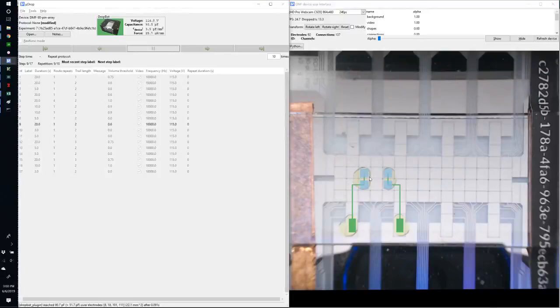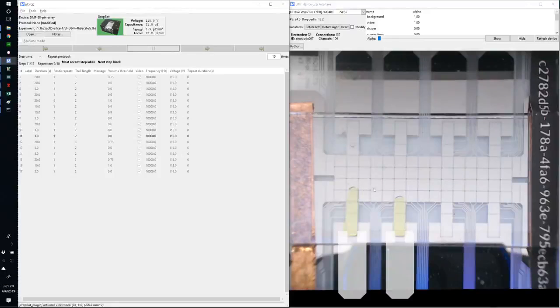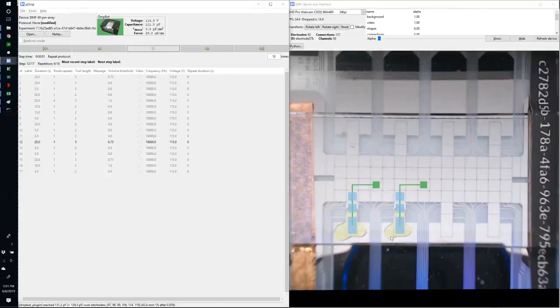Now, this is repeatable on this chip where the left side gets more volume, and so I'm bringing to compensate for that and allow the protocol to repeat. I'm pulling the liquid back into the corresponding reservoirs, and then bringing the entire reservoir volume from both of the reservoirs onto the chip, merging them together, and then splitting that bulk volume into 2 again, so that both reservoirs should have approximately the same starting volume for the next iteration.